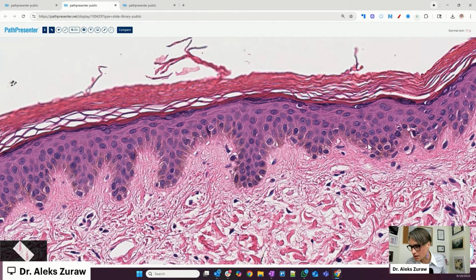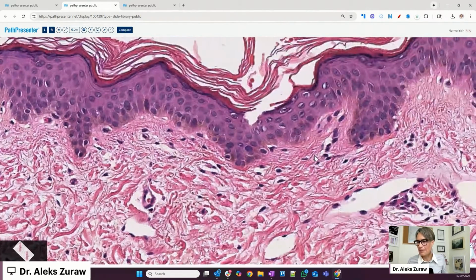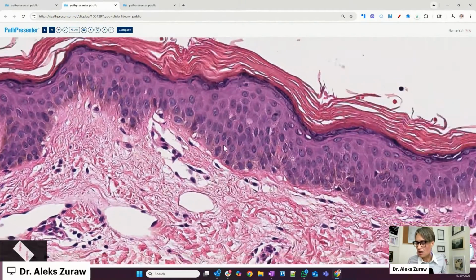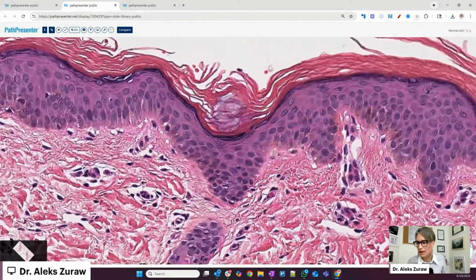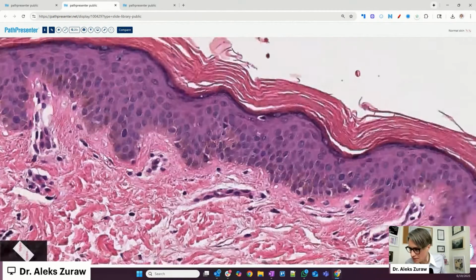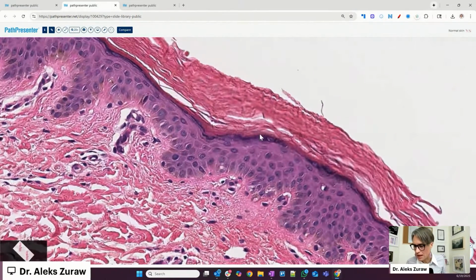And what we should see there are mitosis, because this is something that is regenerating the skin. This is where the cells are growing. This is where they are proliferating, dividing, so that we can have all this protection layer. I don't see any mitosis. Maybe later when you guys look at the slide.